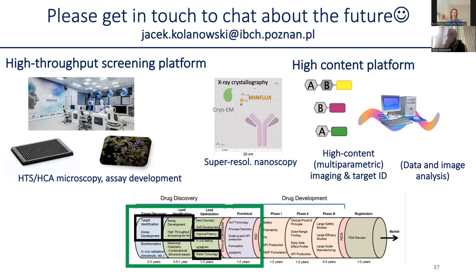So we could even use the intrinsic endogenous systems to study how they behave. Very commonly, it is done even without the need of putting bioluminescent systems inside the fungi, but rather using typical stains for the cell wall of the fungi, because they are very specific. So of course, you could try to modify fungi and introduce bioluminescent systems in them, as we do with viruses, but it is more complex because the system is more complex. You could also use other techniques to visualize fungi, like staining specific elements of the fungi which are not present, for example, in our cells, like the cell wall.